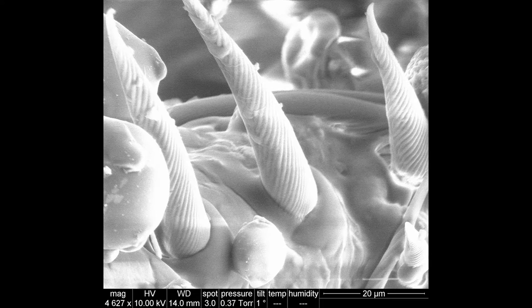And are y'all able to see the finer structure on the spike, or is it too blocky? Well, I'm not sure if it's... Okay, now I see, like, stripes on it? Yeah. These spikes have this kind of stripe feature, and these stripes are maybe a micron in width. So definitely not visible with the human eye, because that's 1/100th of your hair width. So very, very fine features.